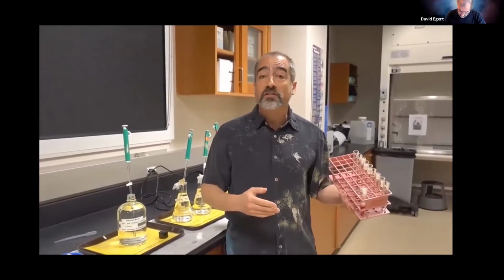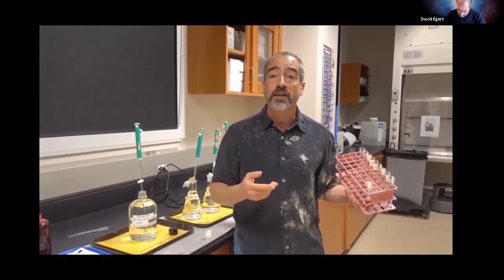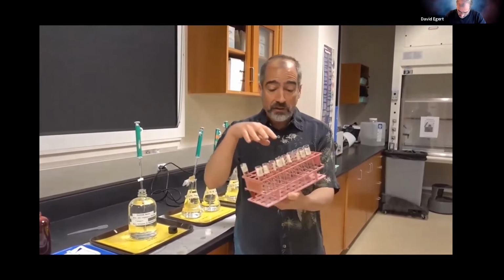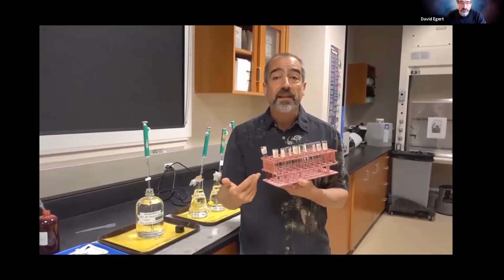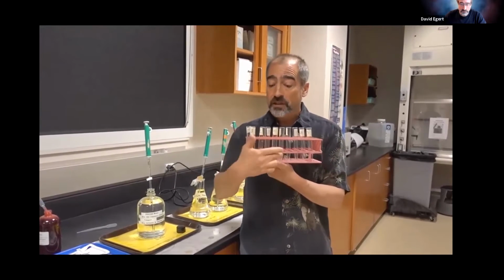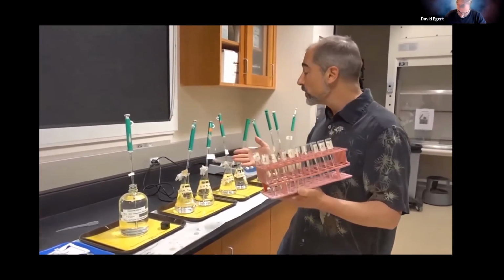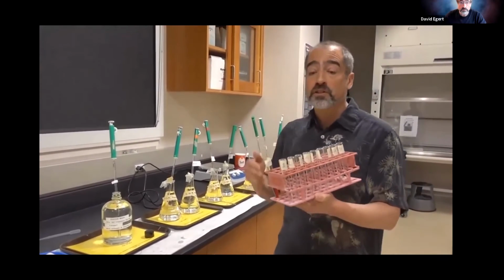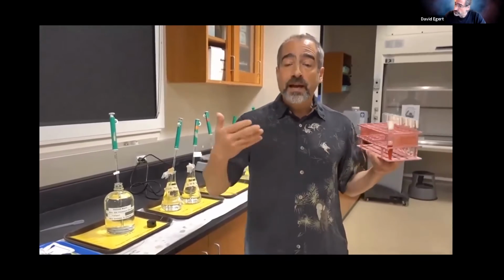It's even worse if you're going super, super fast, high-speed centrifuge, and we don't want any disasters. And you need to make sure Tina will talk more about the balancing, but part of the balancing is making sure each of your tubes is got the same volume. So what I'm going to do is I'm going to put 0.3 mils of each of the appropriate solutions into their appropriate test tubes, and then we will come back in a moment.